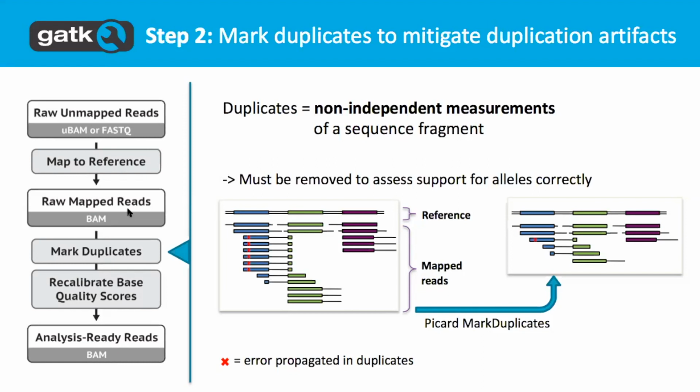Sorry, what's instead of BWA? The variation graph toolkit? Oh, graph. Sorry. Yeah, we're not currently using graph-based references, if that's what you mean, or graph-based alignments. We're not using that yet.